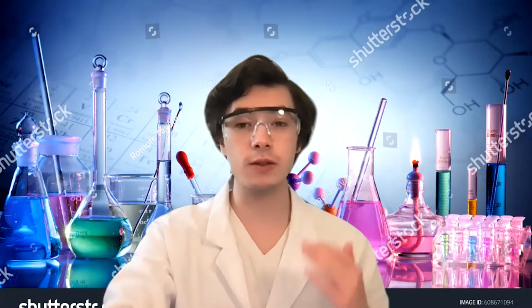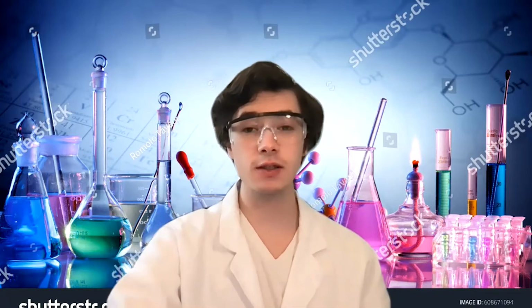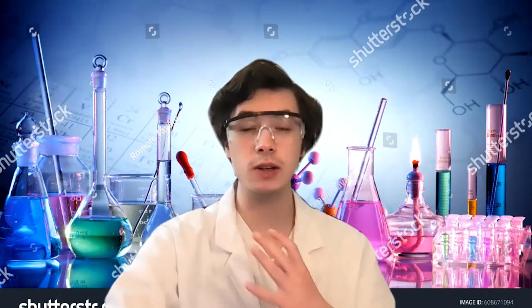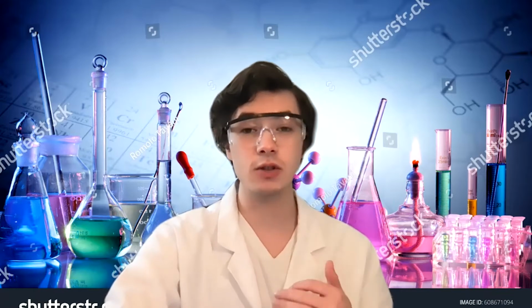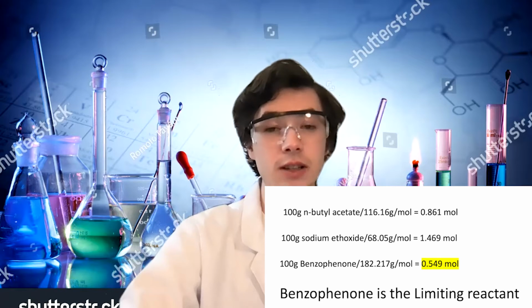To do this, we first have to find out what the limiting reagent is. To do this, we start with a set amount of grams for each reactant and then see how many moles we get from each of those compounds. Whichever one gives us the least amount of moles is our limiting reagent. So with the calculations, we see that benzophenone is our limiting reagent.